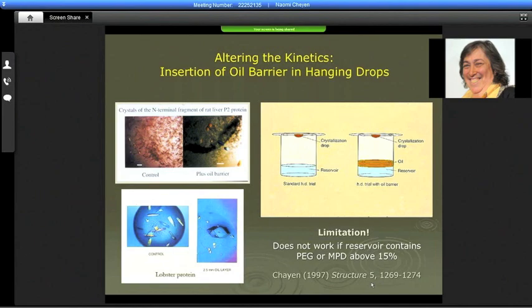You could also do it in different ratios. Half paraffin, half silicone works well in most cases, but sometimes you want to slow it down even further, and then you can take 70% paraffin and 30% silicone. Or if you want it quicker, you do it the other way around: 60% silicone and 40% paraffin.